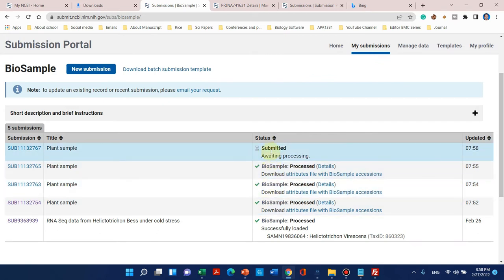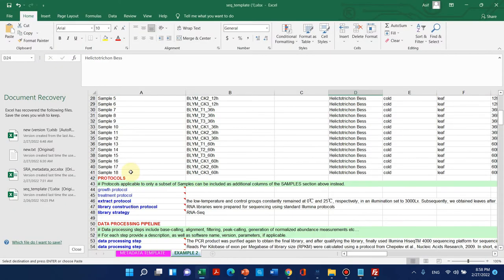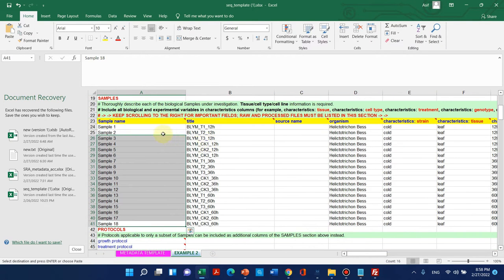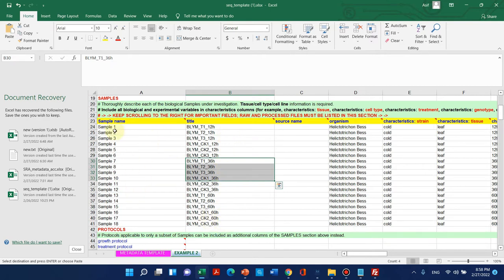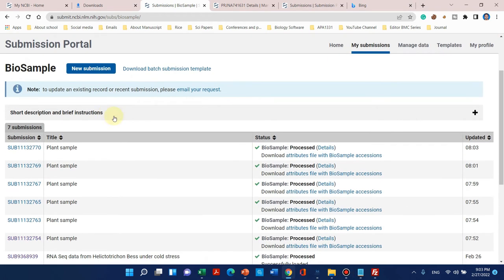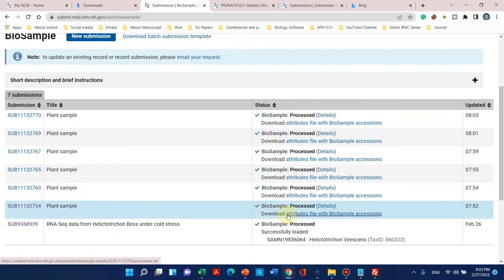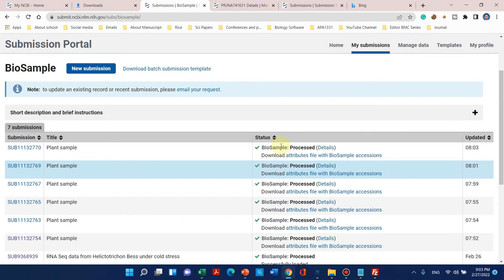Similarly, we need to submit all of our BioSamples as individual treatments. In my metadata I have a total of 18 samples, with six conditions and three repeats each. We only need to enter six samples because the three biological replicates are automatically included in each treatment. We can see that all six BioSamples have been processed — one, two, three, four, five, and six. All BioSamples are processed.